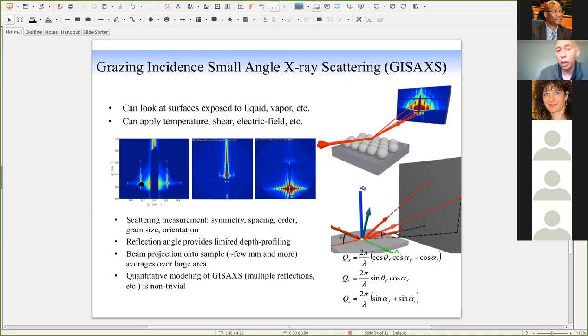You can see in some of the previous ones, where we were doing radius of gyration, for example, you have to try to set up the experiment so that each molecule is independent. There is nothing else close to it. You have a set of independent things.